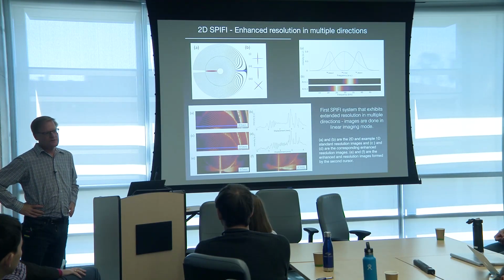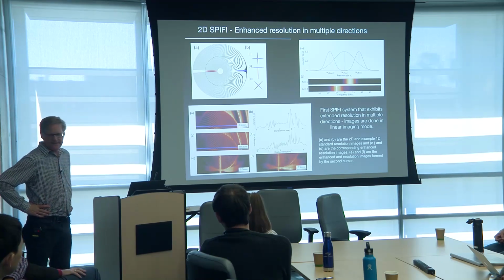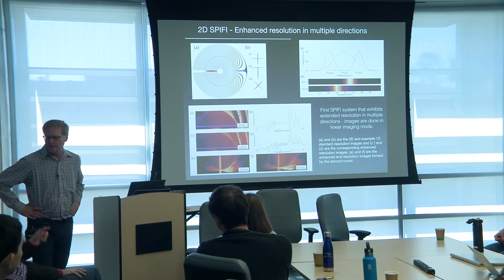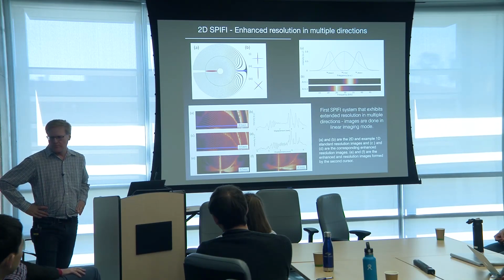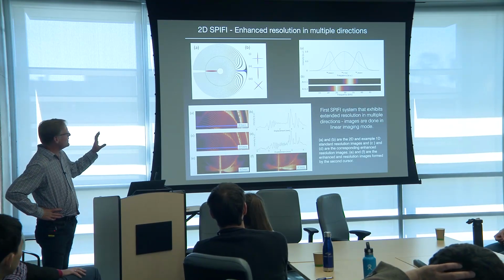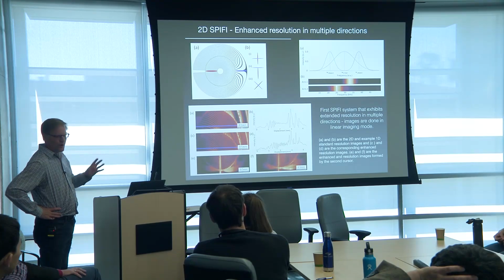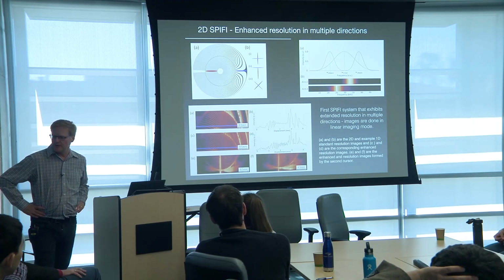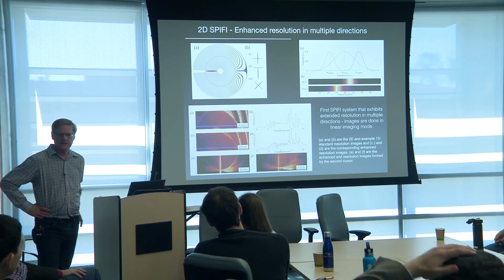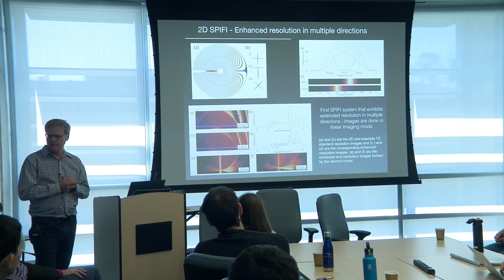If you have artifacts in your mask, that can put some noise in the background, but in general we're doing pretty good. So you're doing a direct sampling of the Fourier domain. Wobble and stuff we've corrected for. We can correct for all of that, and that's where I think the longer term, where Randy's working on inverting all this, is going to be much more powerful.